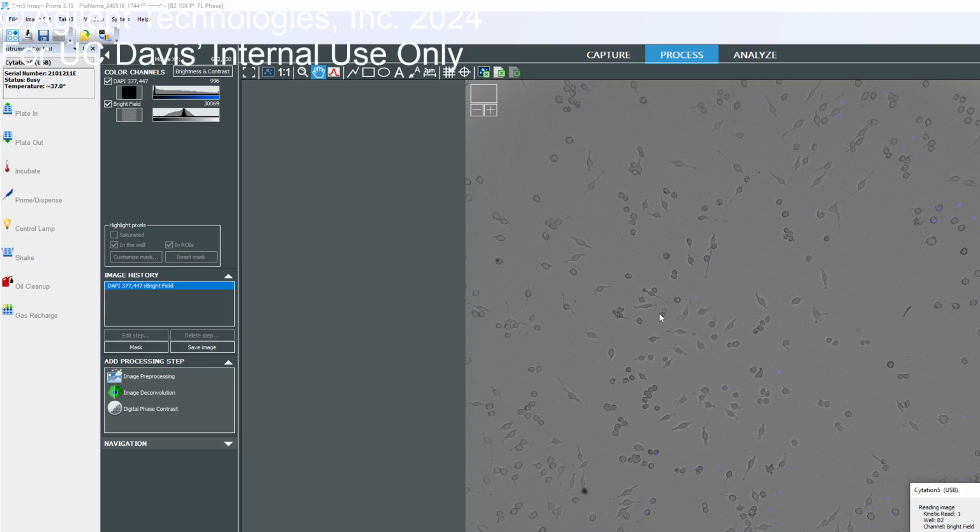Oh, really? So that it's good? So within every 30 seconds, I want it to start moving to the next well. It will, when you set it in an experiment fashion. Right now, imager manual mode is limited to one well only. Right, exactly. But I'm just training it to do it this way. Exactly. And then the experiment would contain all the information.